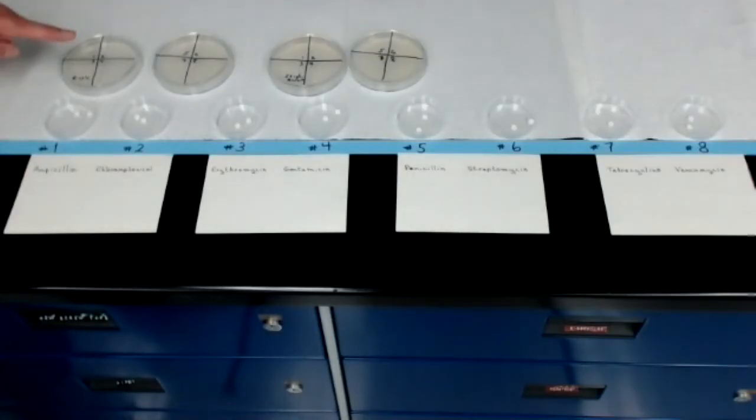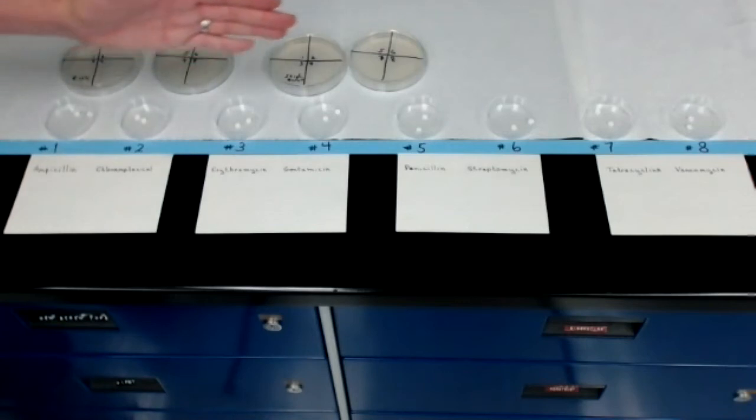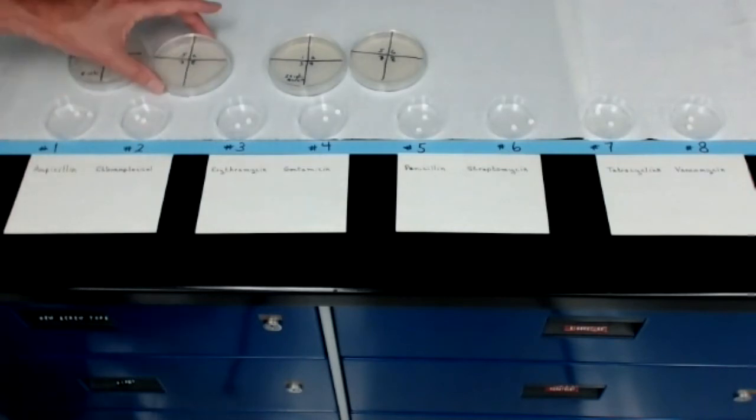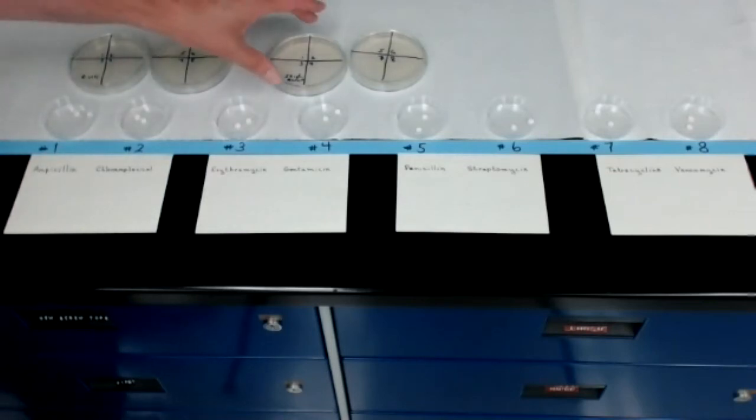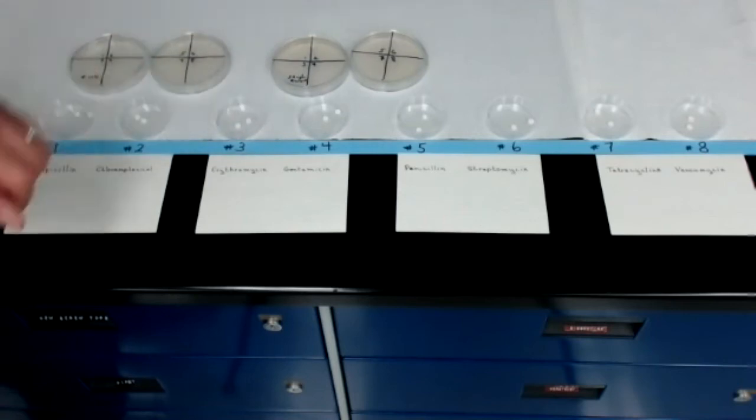You'll also notice that immediately above the row of small dishes, there are 4 larger agar plates. These 2 plates, the ones that are farthest to the left, have been swab inoculated from an E. coli broth. The 2 plates that are on the right have been swab inoculated from a Staph aureus broth.